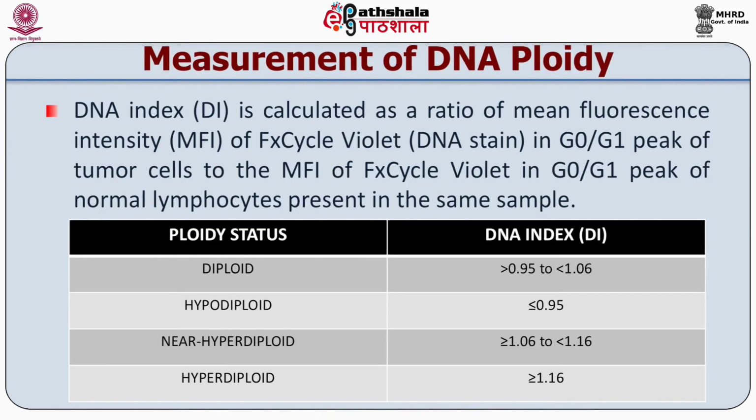The measurement of cellular DNA content by flow cytometry uses fluorescent dyes that intercalate into the DNA helical structure. The fluorescent signal is directly proportional to the amount of DNA in the nucleus and can identify gross gains or losses in DNA.